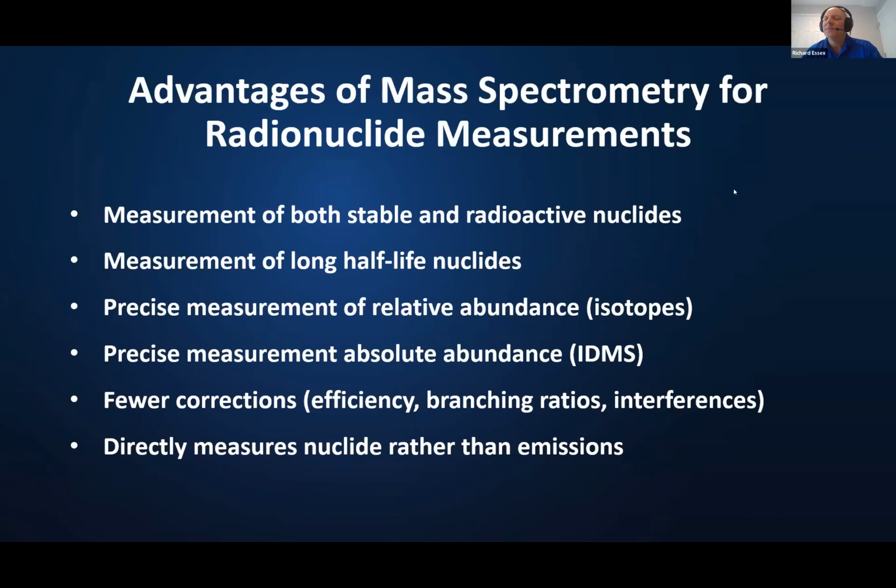It depends a lot on your sample. When it comes to our primary measurements, at k = 2, we're as low as 0.5% uncertainty, all the way up to maybe 1.5 or 2%. We're very, very tight on the primary measurements.